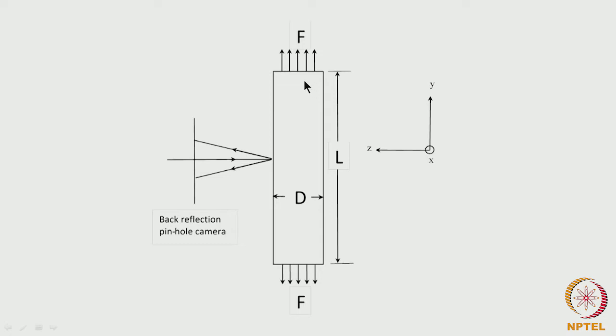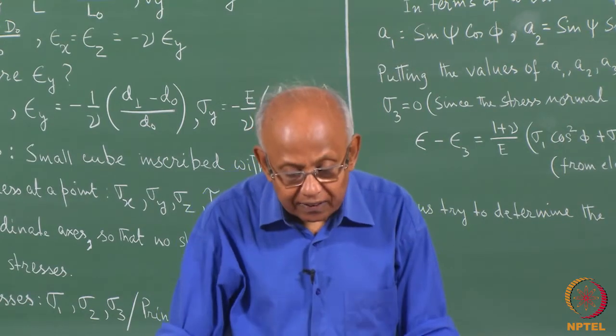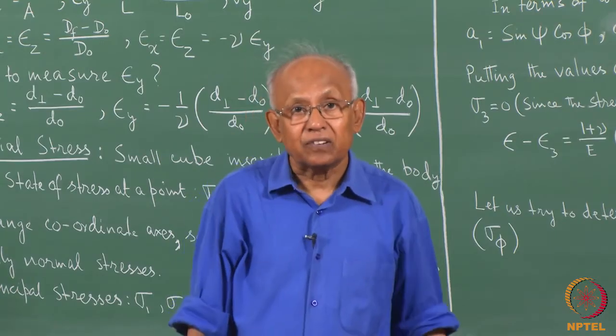Due to the tensile stress, the interplanar distance will increase, there will be an expansion in this direction. So, because of the expansion, the interplanar distance will increase, and if we can measure the interplanar distance after applying the force and also can measure the interplanar distance when there is no force on the body, then we can calculate the strain in the y direction.